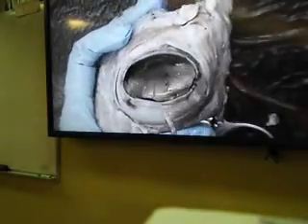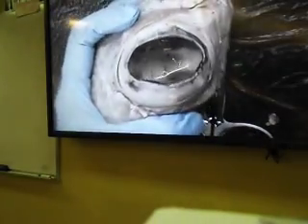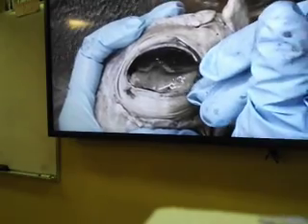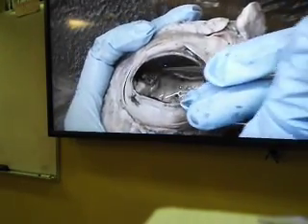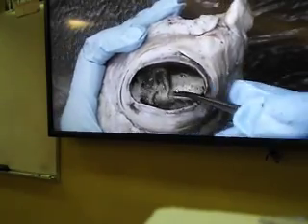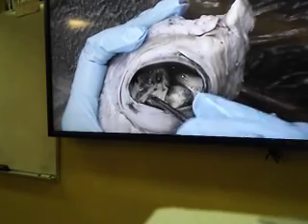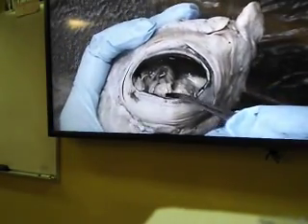And the retina is, as we already saw, stuck on the back of the eyeball because the vitreous humor is pushing it. So it's the beige or creamish colored apron-like structure. And as you see, what am I doing? I'm gently pulling the retina like an apron and piling it into one area. Alright? Okay, so retina, this is all we can see.